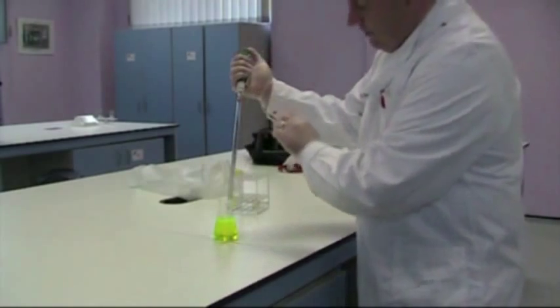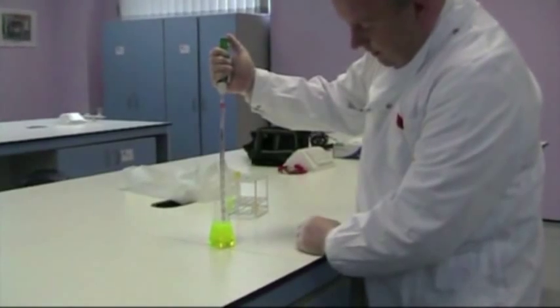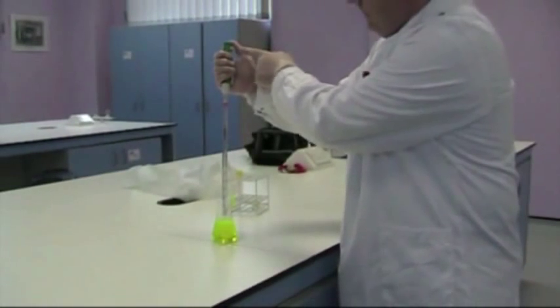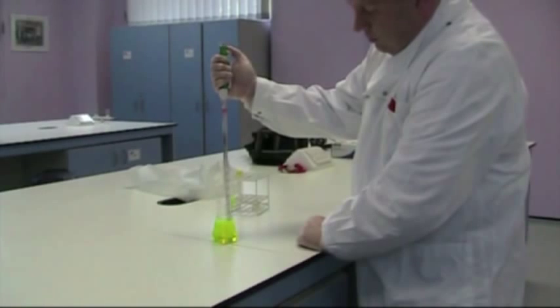Then transfer over to the liquid. Place the tip of the pipette into the liquid, and using your thumb, very gently begin to draw the liquid up to the required level.